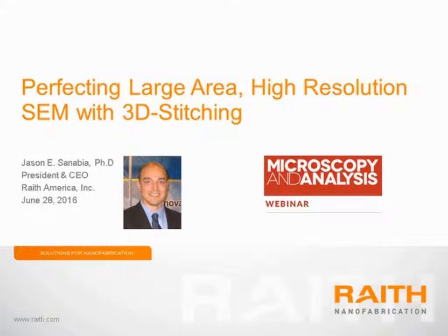I am President and CEO of Raith America, a company whose mission is to support Raith instruments in the Americas and also to drive forward new applications of Raith instruments. Today I would like to tell you about a specific application of Raith technology, and that is large area high resolution scanning electron microscopy with 3D stitching capability.